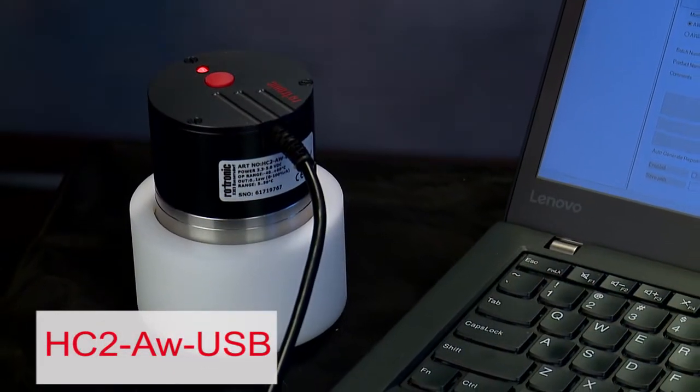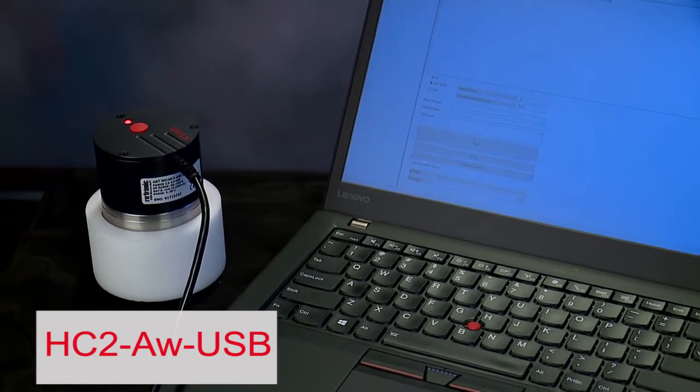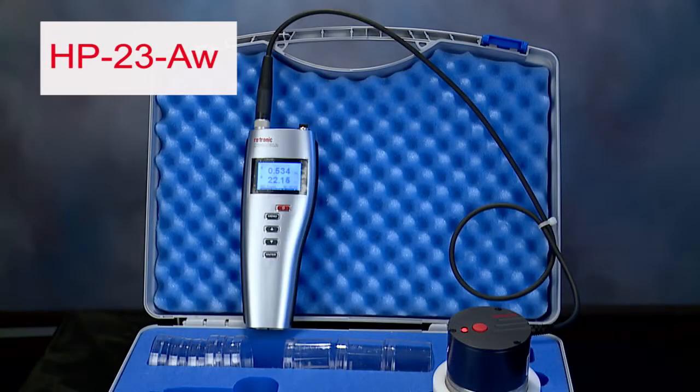In our first two videos on water activity measurement, I reviewed Rotronix's line of AW instrumentation and demonstrated the ease of testing using the HC2 AW USB probe with Rotronix HW4 software and the use of the HP23 AW set. Today, I'm going to go into more detail on how to calibrate the popular HP23 AW portable water activity instrument set.